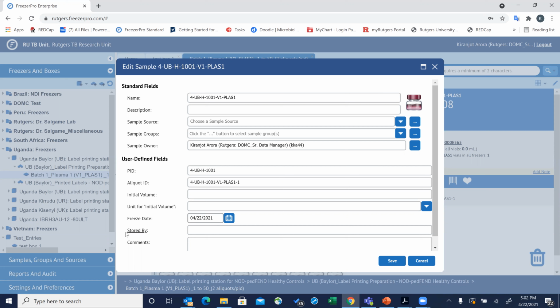And when you see an underline on any of the variables or user-defined fields, that means that the DOMC staff has some directions as to how to complete this field. And then if you just bring the cursor on top of it, you don't have to click anywhere. It just says the initial. So just enter 2 digits initials in this area.